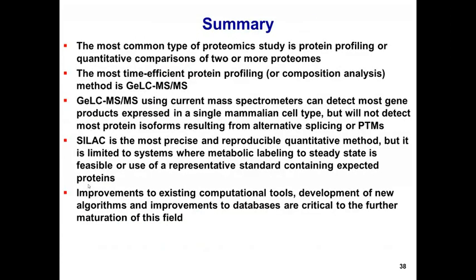So in summary, the most common type of proteome study is protein profiling, which is quantitative comparison of two or more proteomes. The most time-effective protein profiling method is probably gel LC-MS for most samples.